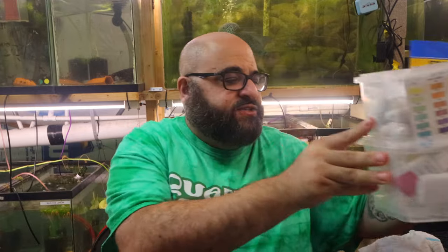Most people say this is the best way to test your water — it might be. There are other liquid test kits available in the United States; Nutrafin has one and there are a couple others. There are also larger test kits that test many other water parameters, especially if you have a marine tank. But in the United States, the API Master Test Kit is the gold standard of liquid tests.